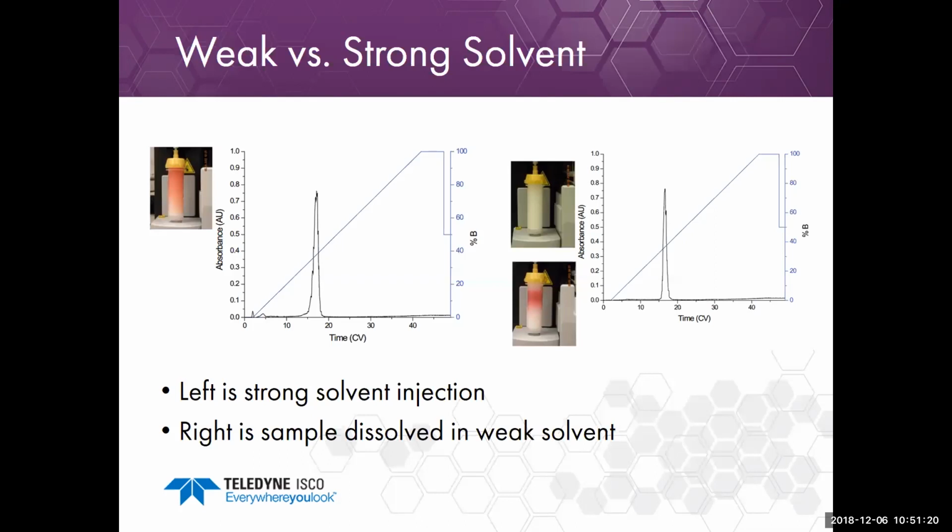Okay, another question is, I observed two peaks once for the same compound, but the same compound elutes as one sharp peak on the same set of conditions without any change. Could I explain this?